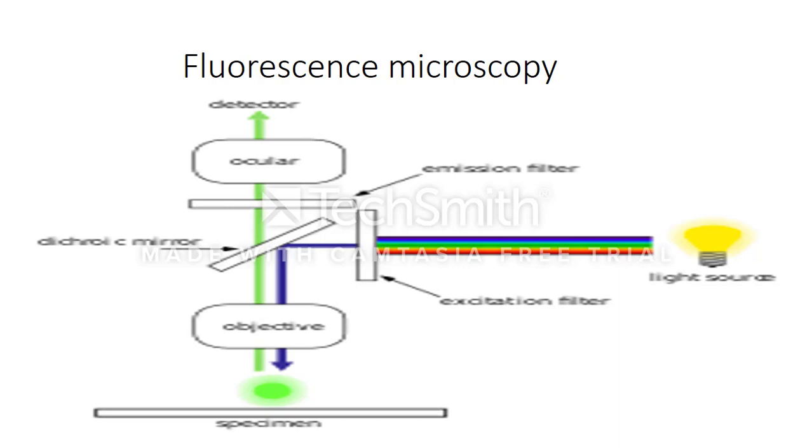So these fluorochromes absorb energy, and that puts electrons in the fluorochromes into a higher orbital, which is more unstable. And considering it's in a more unstable state, the instability causes the electron to drop to a normal orbital, and this releases energy as visible light, which is considered fluorescence.